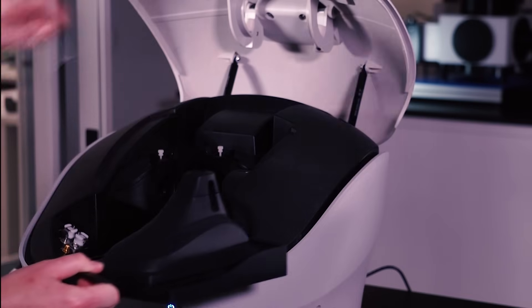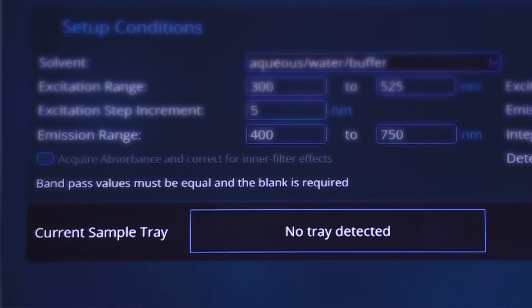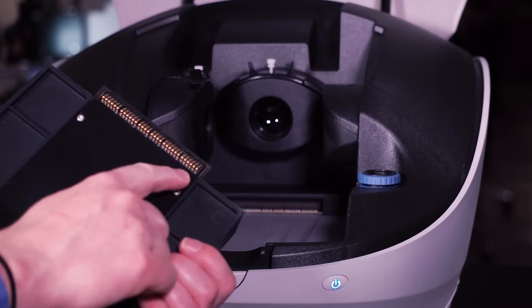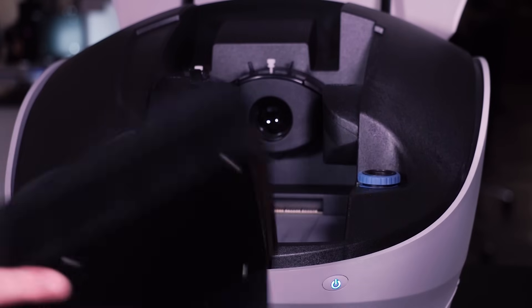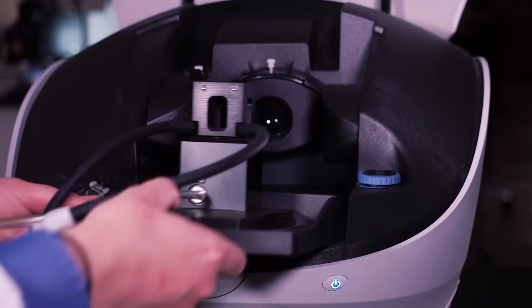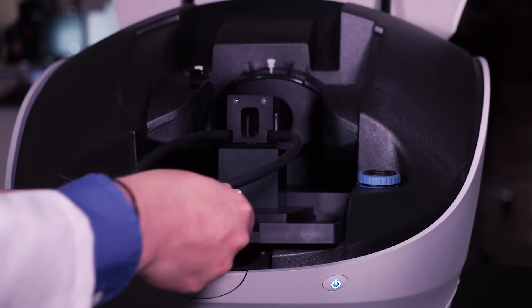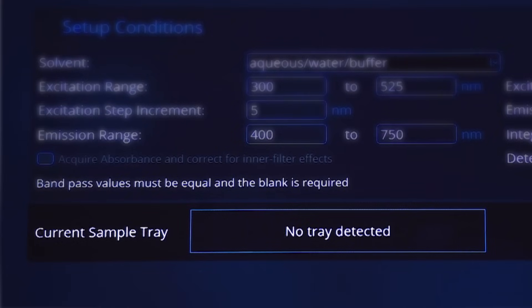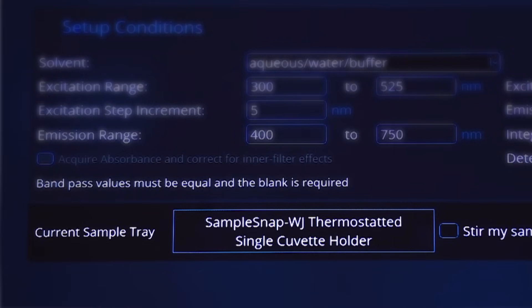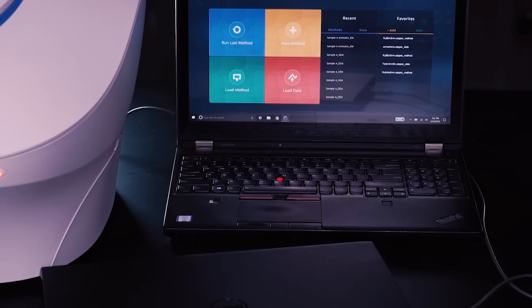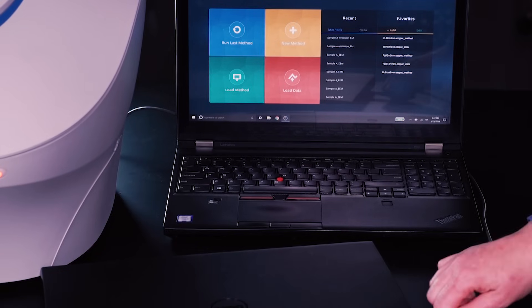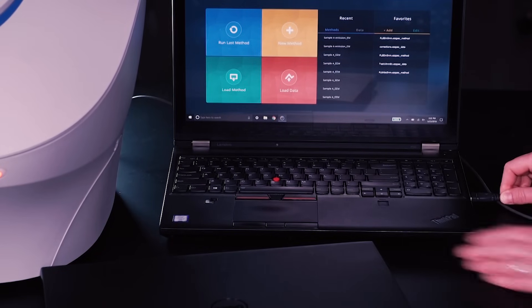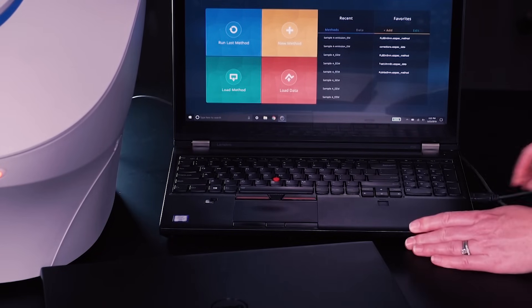The software automatically configures itself after recognizing your sample tray. Duetta is fully automated and fully corrected for completely accurate data every time for every user.